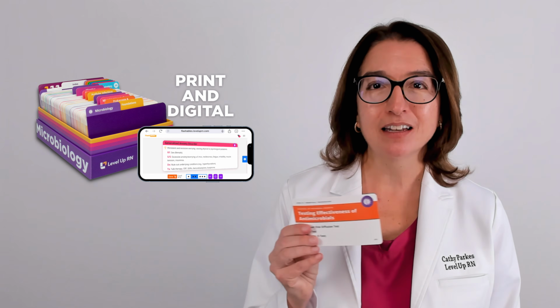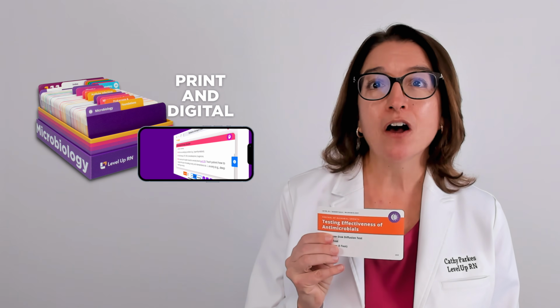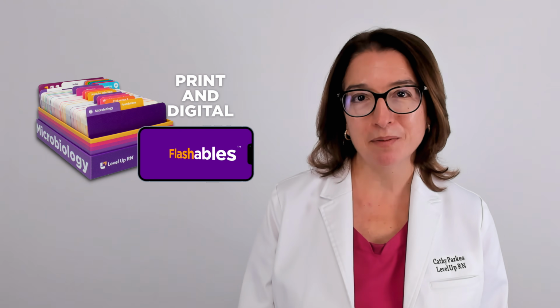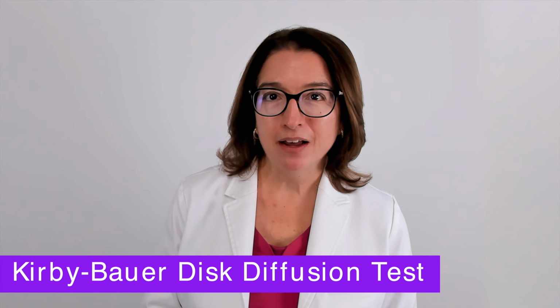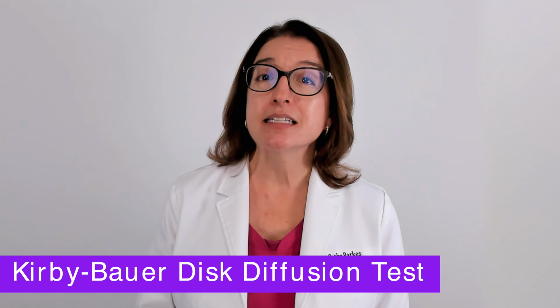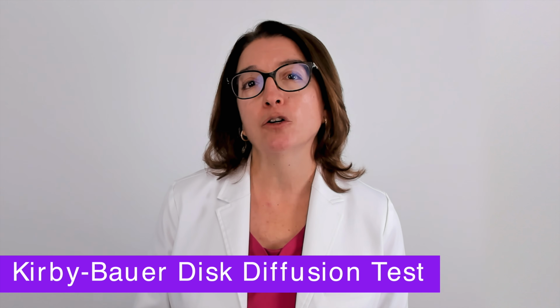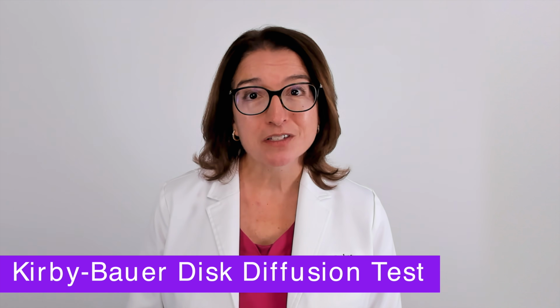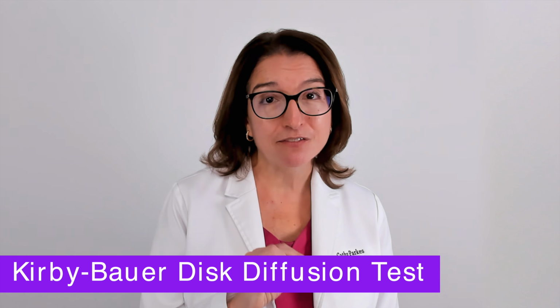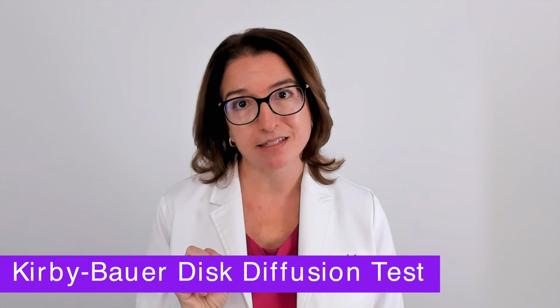And if you have our Level Up RN microbiology flashcards, pull out your flashcard on this topic so you can follow along with me. The first test we're going to talk about is the Kirby-Bauer disc diffusion test, which tests the susceptibility of specific microorganisms to antimicrobial drugs. In other words, we are trying to see if a specific drug can inhibit the growth of a specific microorganism.